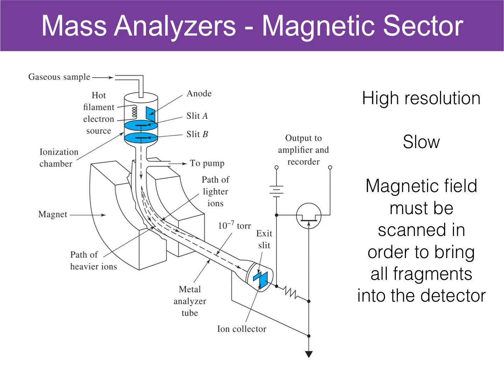Okay, so now let's talk about the mass analyzer. This is really the monochromator of the mass spectrometer. It's how the ions are separated by m/z ratio. And this original sort of magnetic mass selector with this curved path lets some ions through and causes the others to be too light and run into the wall or be too heavy and run into the wall.